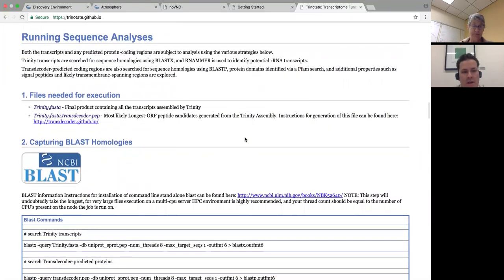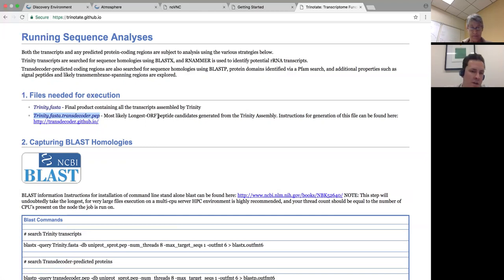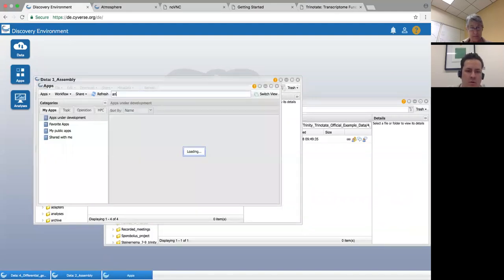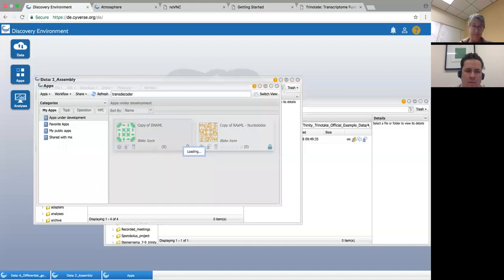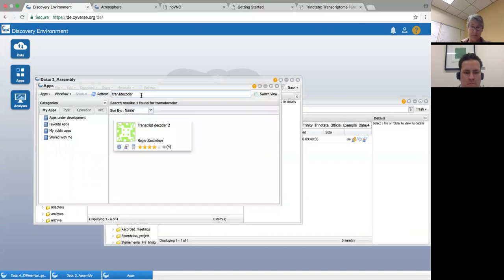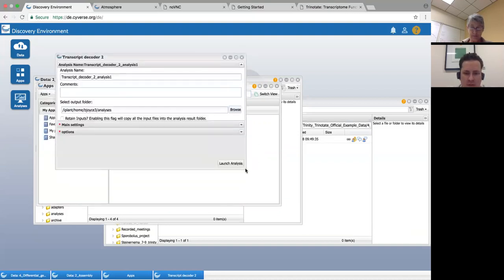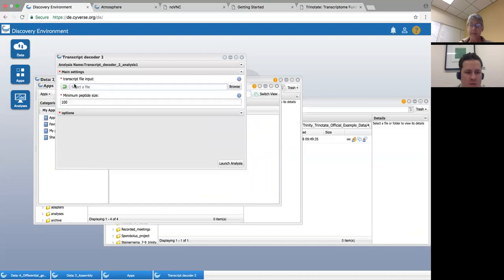That actually allows us to get right into running the app. All we need is the Trinity FASTA file we generated last time, and one more thing: we need to take that FASTA assembly and turn it into open reading frames. You can do that in the Discovery Environment, and that's my preferred method. If you go into apps and look for something called TransDecoder, you open it up — it's a very simple interface like we had seen before with some of the trimming apps.